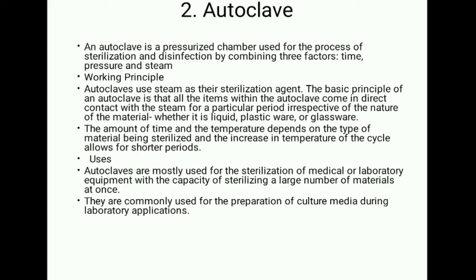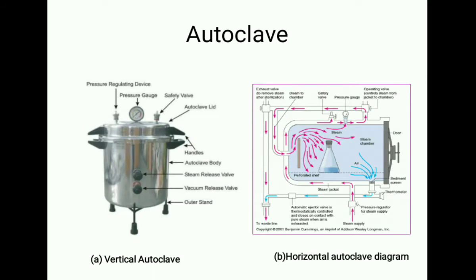They are commonly used for preparation of culture media during laboratory applications. So here you can see a vertical autoclave that is mostly used in laboratories, and on the other hand we have horizontal autoclave.